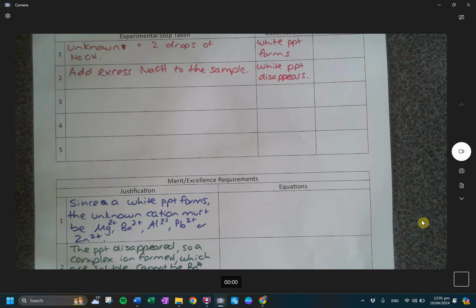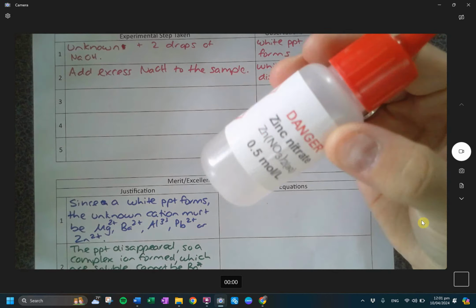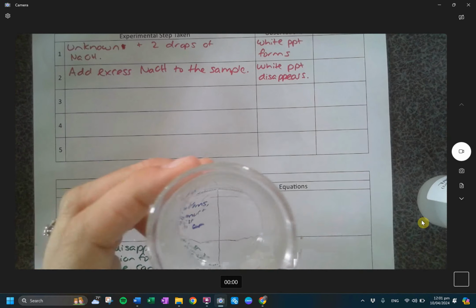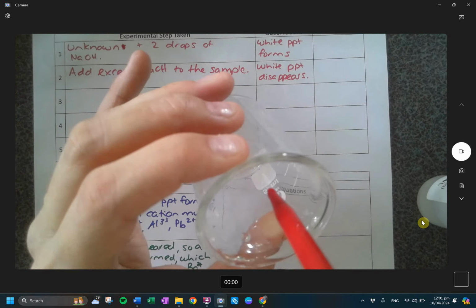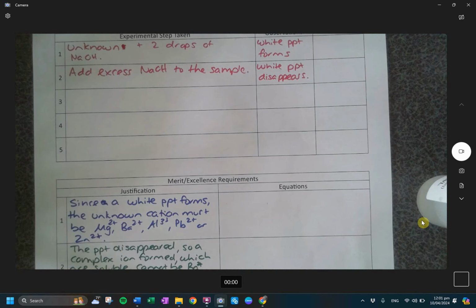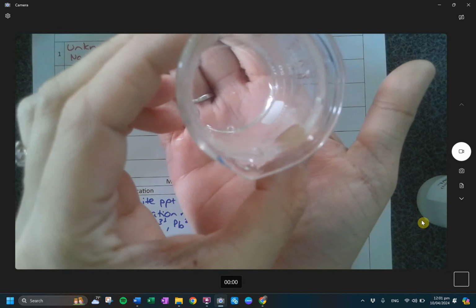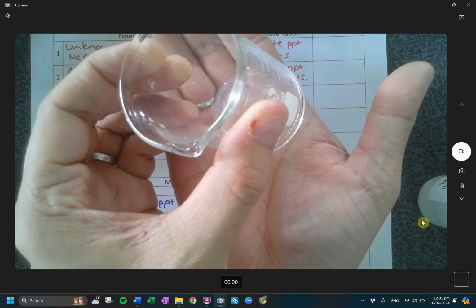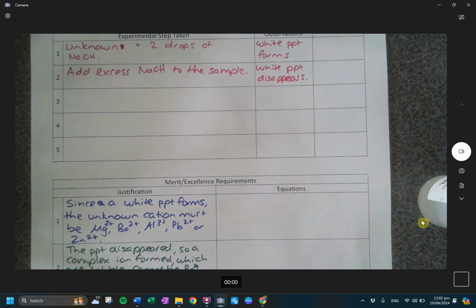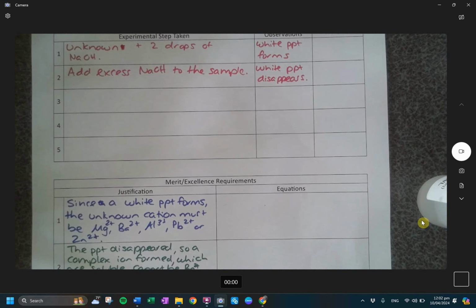And then I'll just dump this out so you can see what zinc looks like. So I'm grabbing zinc now. Zinc. I'm putting that in here. And then here's my ammonia. So again, just trying to put a few drops on there. And it also has that white jelly-like thing. You kind of see it when I concentrate it over there. Are we okay? So they're all kind of similar, and they're all kind of hard to tell apart.